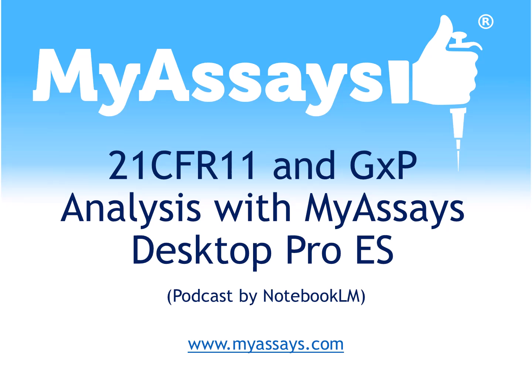Let's move on to Subpart B, electronic records. What are the key things people need to know here? Subpart B really dives into the whole life cycle of an electronic record. How it's created, modified, maintained, kept safe, the whole nine yards. It gets into the nuts and bolts of how you ensure the data's integrity. And from looking at the documentation, MADS seems to really shine here.